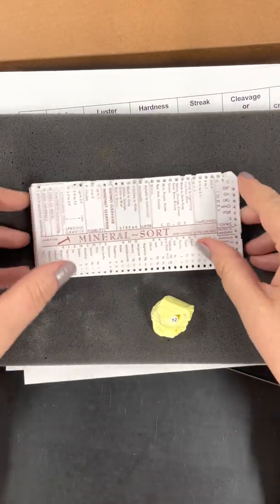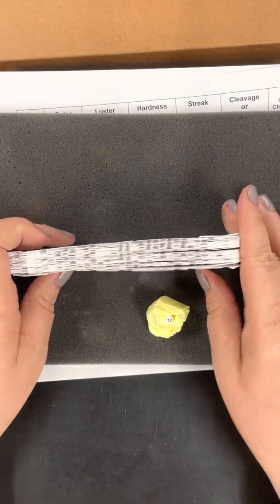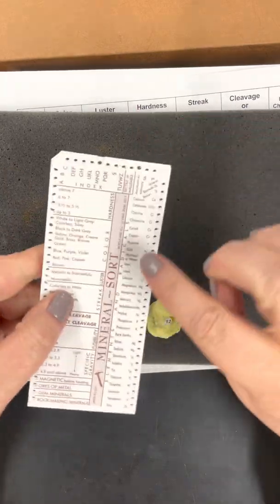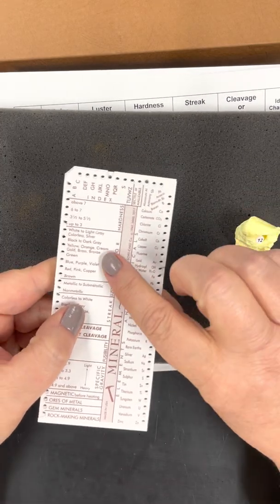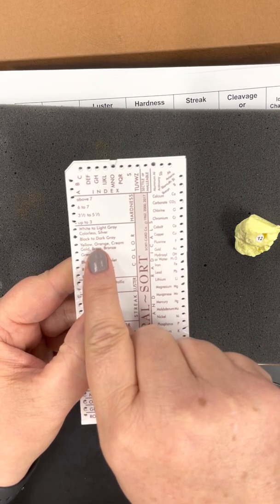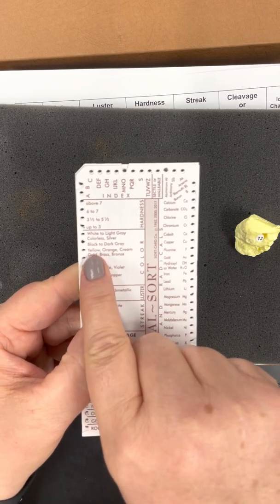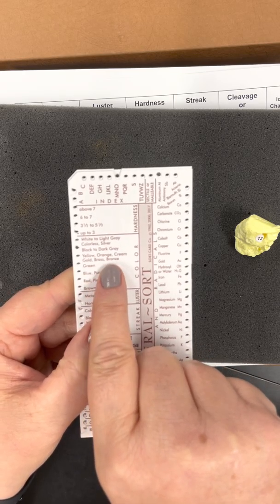So I've got all of my little cards right here. And what we were going to do is I'm going to start with color because that's the most obvious one for this one, number 12. And if you look on here, we've got different types of color. I do have one that says yellow, orange, cream, gold, brass, or bronze.